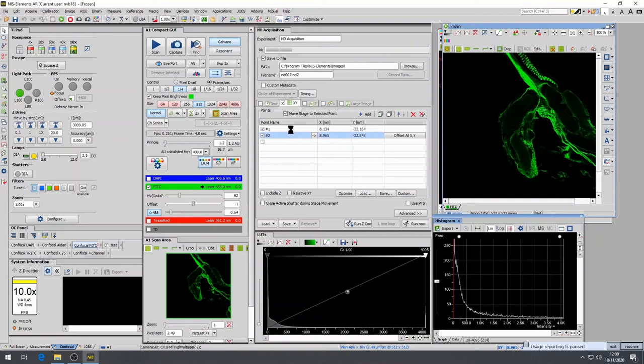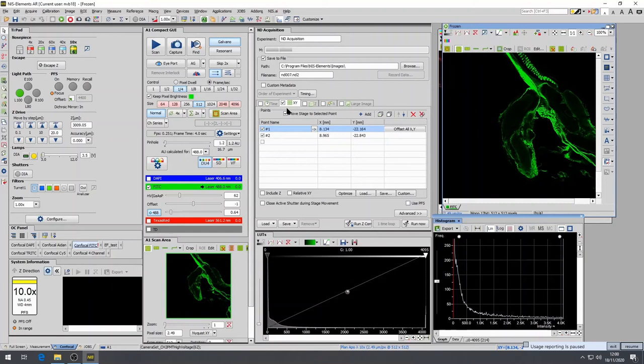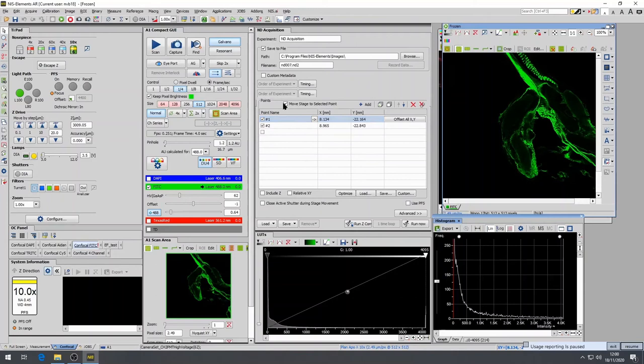It is very important and worthwhile to remember that if the Move Stage to Selected Point is enabled, the microscope will automatically move to the selected point. This may be inconvenient, or in certain circumstances, it can cause damage to the objective if multiple points are selected that span multiple slides or multiple wells.